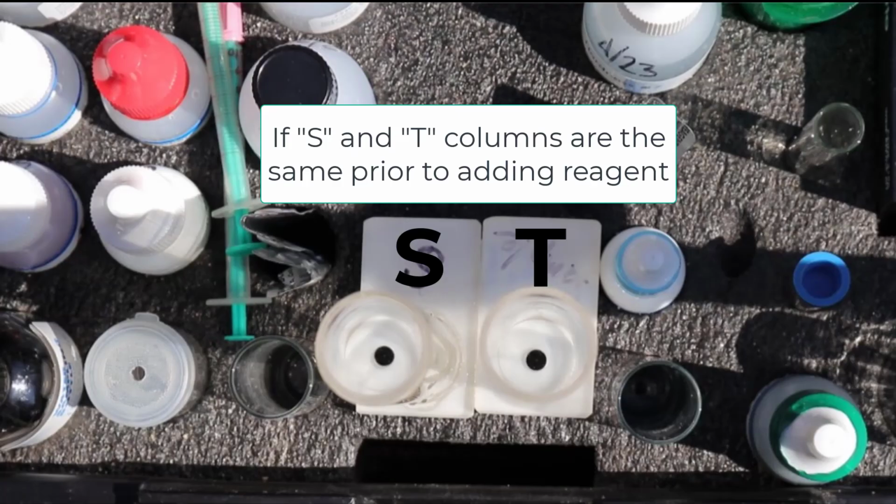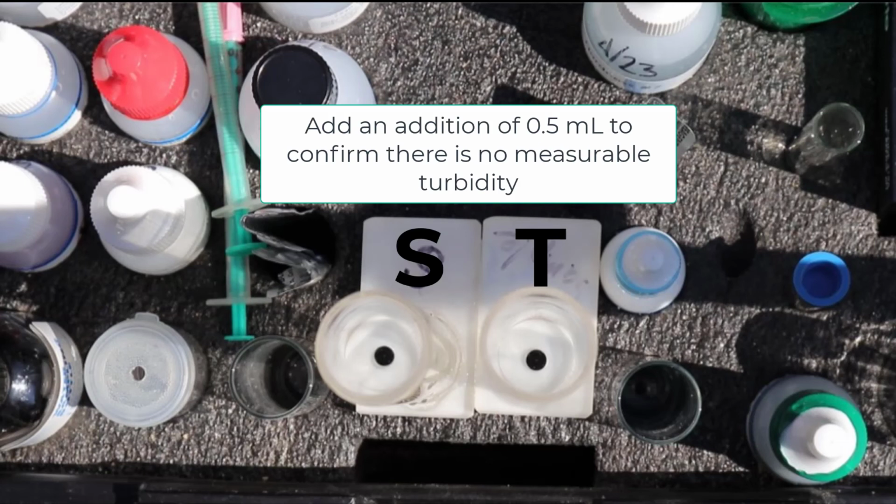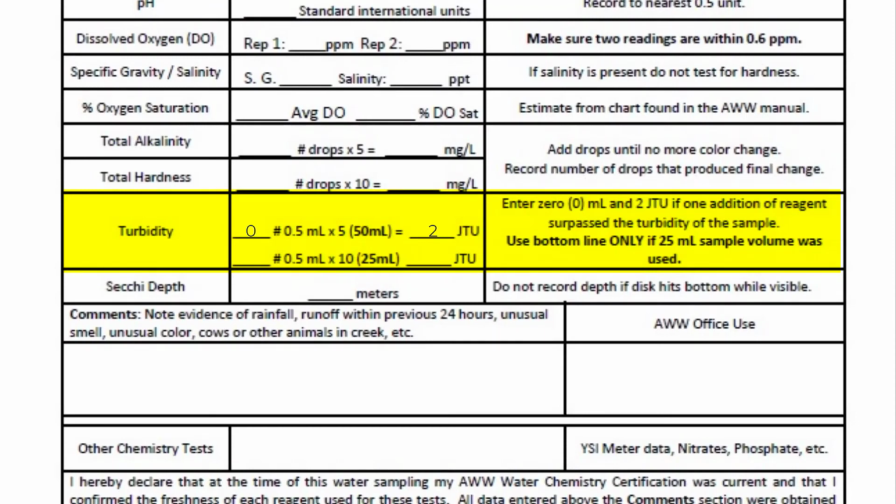In some cases, your 50 milliliter water sample might be so clear that the dots at the bottom of T and S columns are equal before adding the standard turbidity reagent. In this case, you should still add one addition of 0.5 milliliters to confirm that this is the case. If the T column is fuzzier than the sample after one addition, you should not count the addition. On your data form, report the number of measured additions as 0 and report JTUs equal 2.